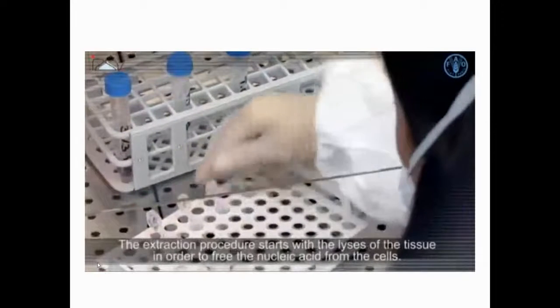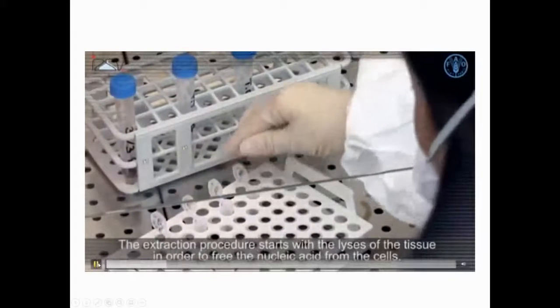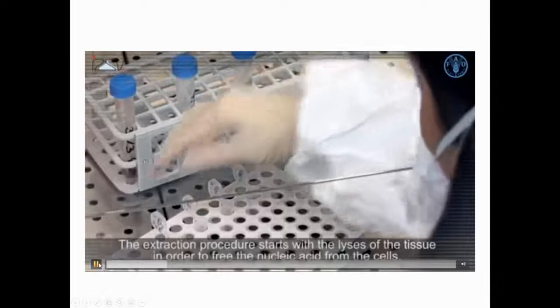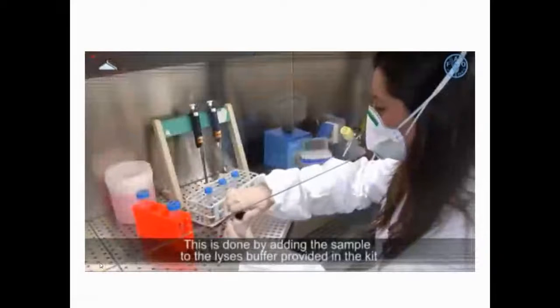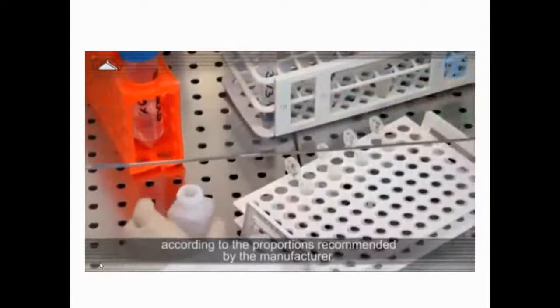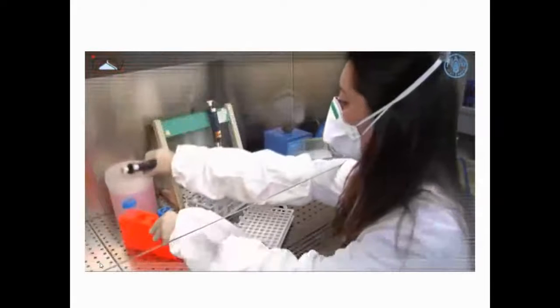The extraction procedure starts with the lysis of the tissue in order to... So the first step always: collect the cell or tissue and then lyse the cell or tissue to release the cell extract. Free the nucleic acid from the cells. This is done by adding the sample to the lysis buffer provided in the kit, according to the proportions recommended by the manufacturer.